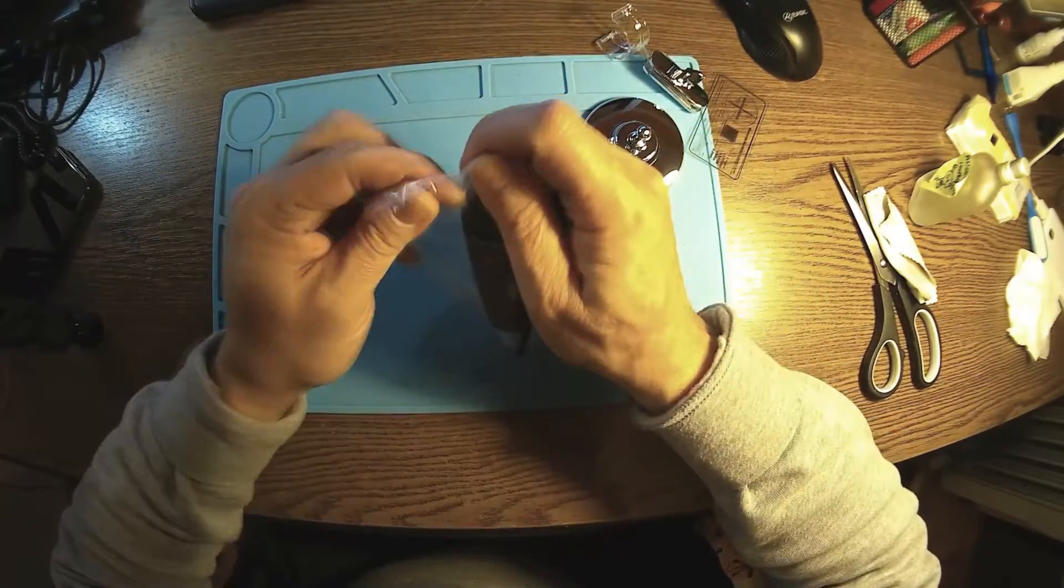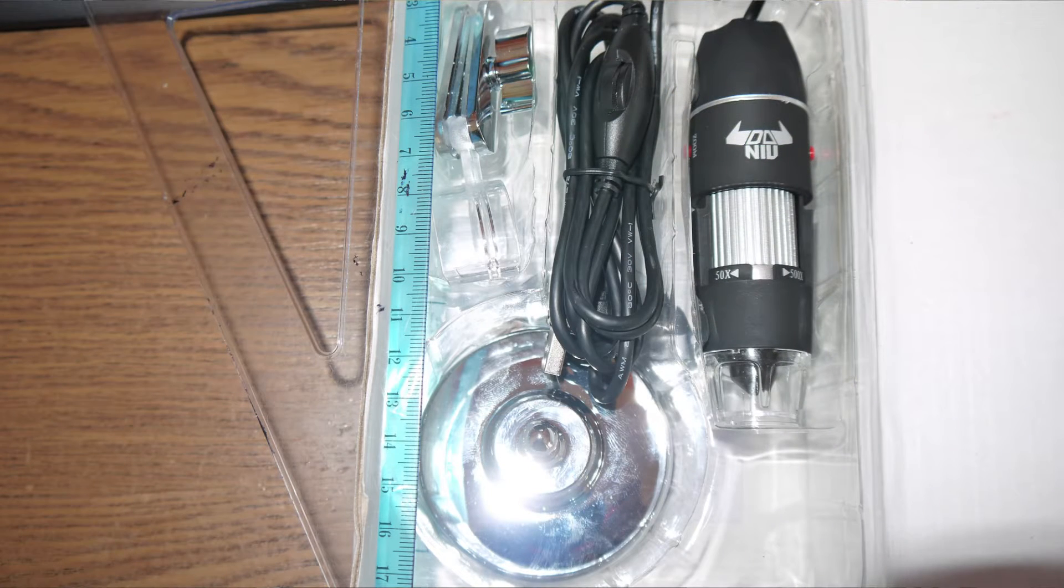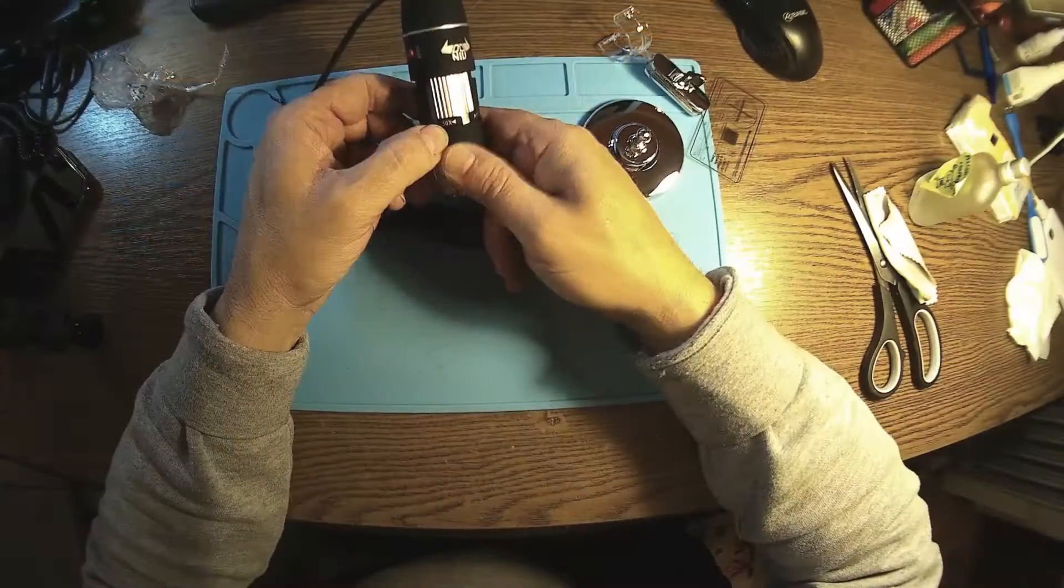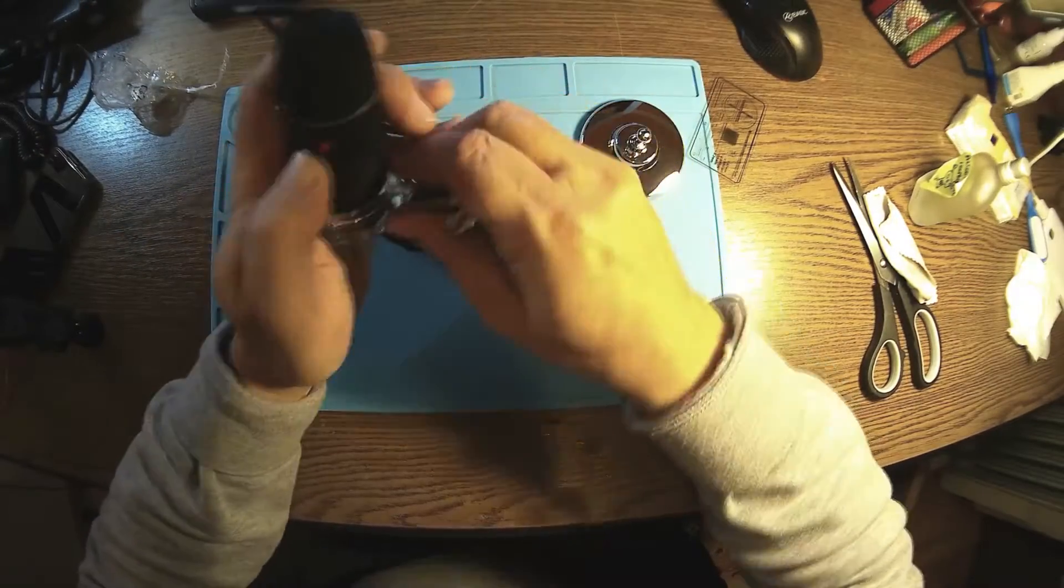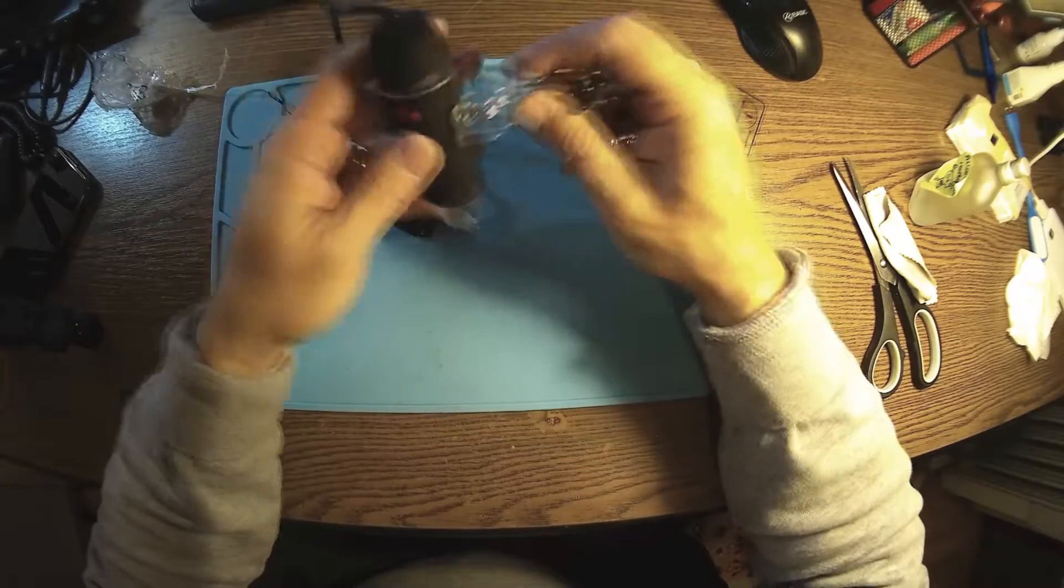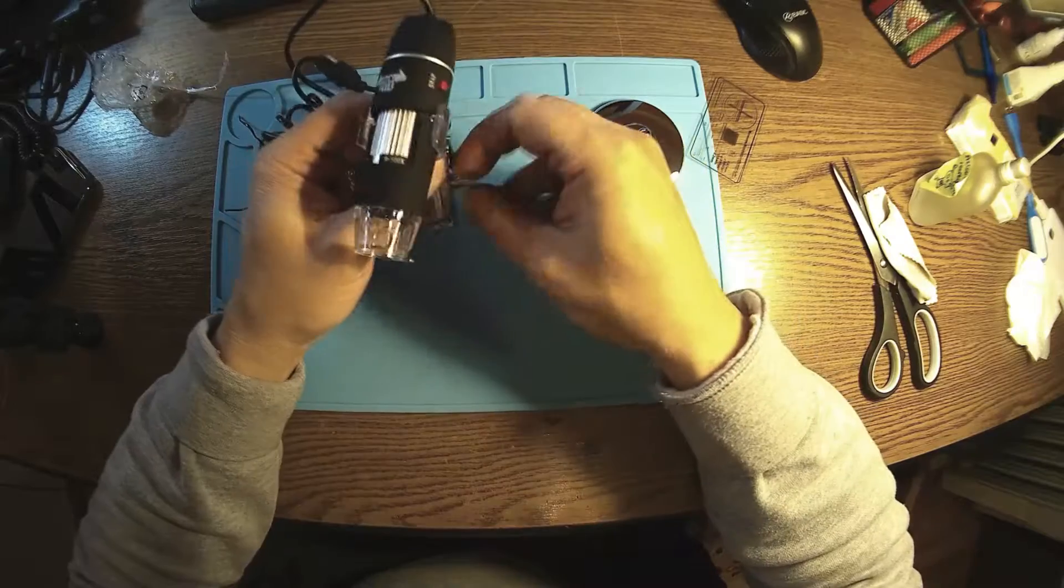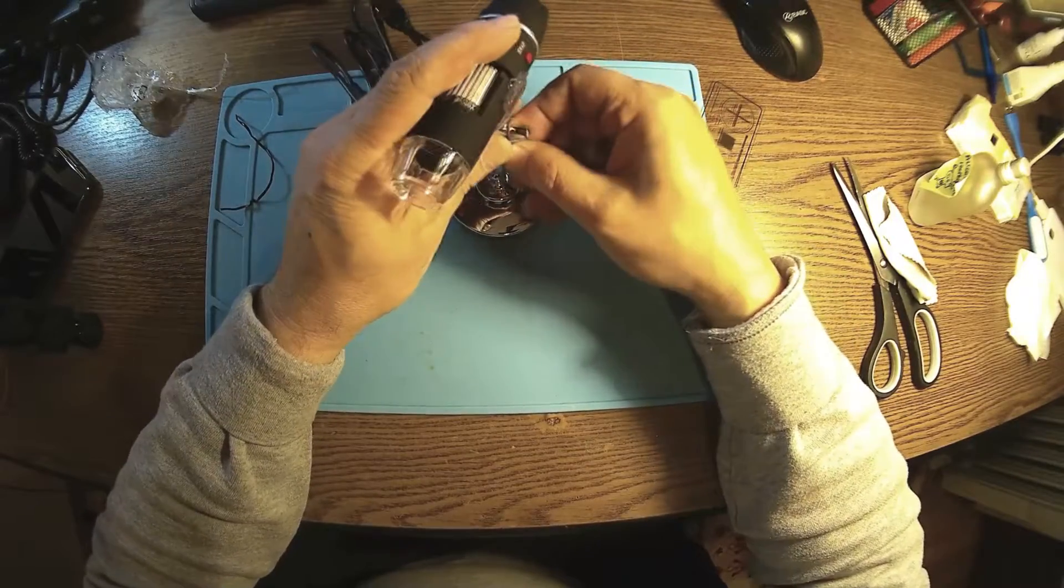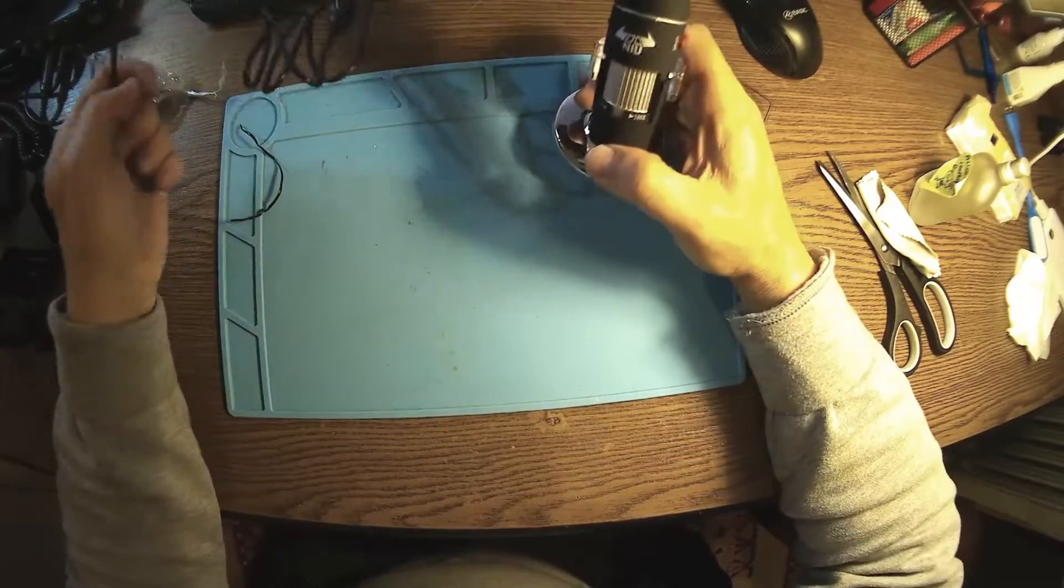To use this one, first of all you better have it on the bench. This is something called Danu and we have 50 to 500 magnification. The support should be up here, it has this special channel somehow, and it's a very simple and rudimentary support. I'm afraid we can't work like that, it's absolutely impossible.